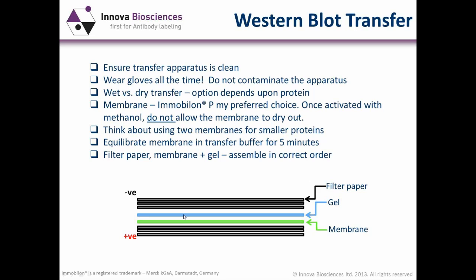One thing to take into consideration is always wear gloves when you're handling proteins, whether in the previous steps, but most importantly at this point in time. And don't wipe your face with your gloves, because all you're going to do is put proteins from your face onto your gloves, which you'll then transfer to your membrane if you handle the membrane with your gloves.